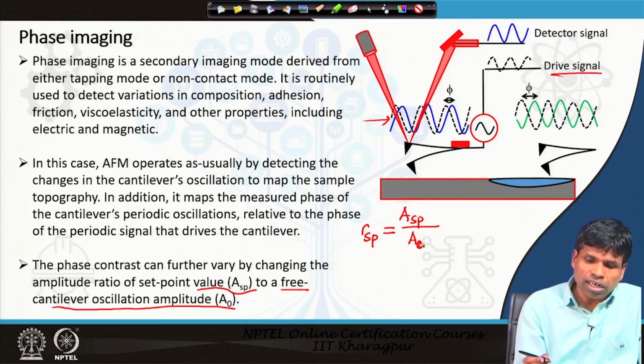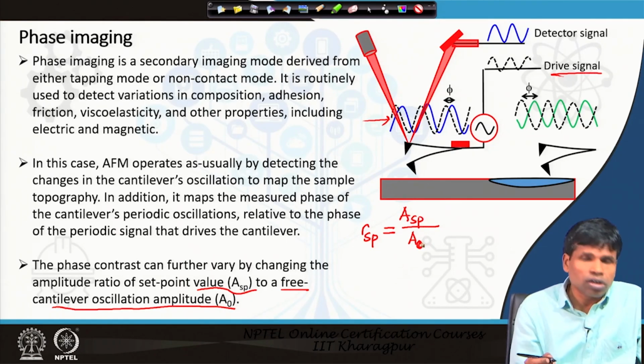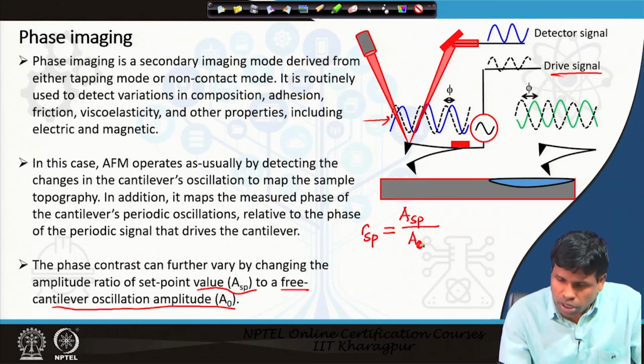This phase shift depends on the quality factor of the cantilever and the spring constant.